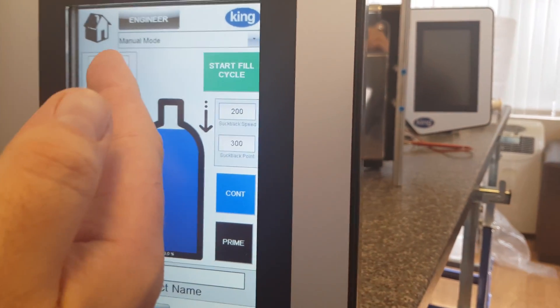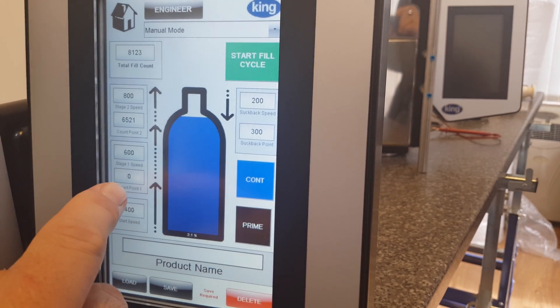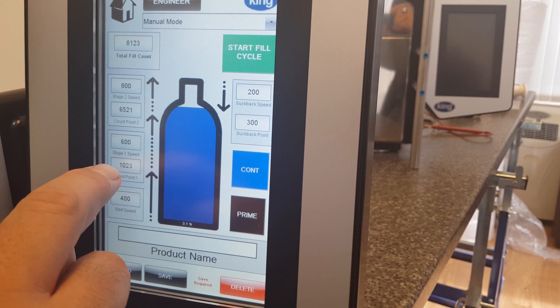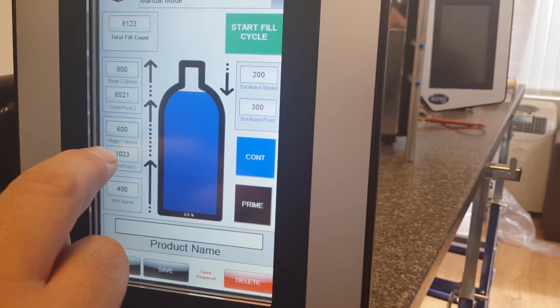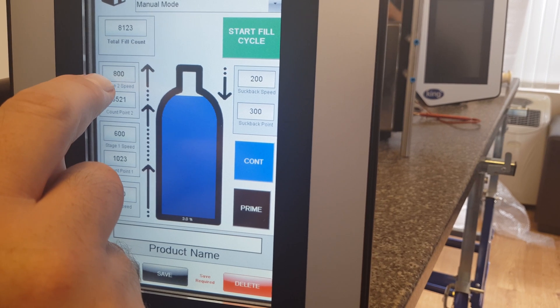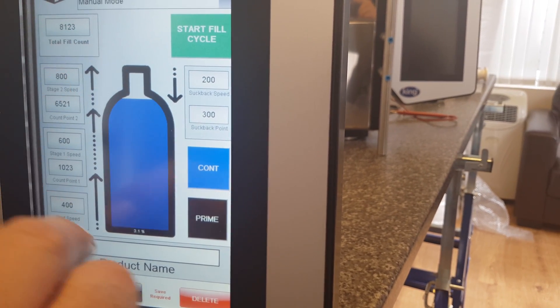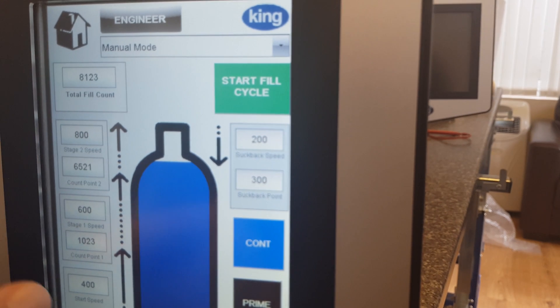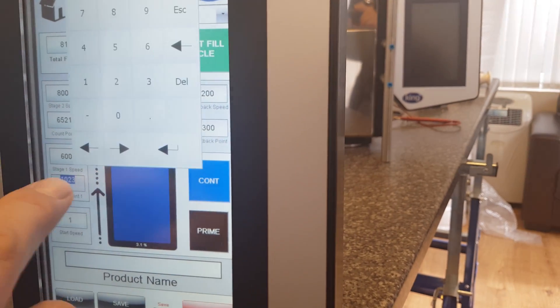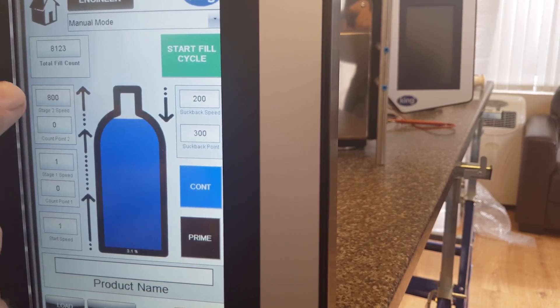So it's going to go at 400 RPM and count 1,023 pulses, and then at that point it's going to change the speed to 600 RPM and count up to 6,521. And then at that point it's going to go to 800 RPM and count up to 8,123. So these points are like stages in the fill — the total count is 8,123, but we start off slow to that point and then go quick. I would suggest that you just leave that at a normal setting: the speed and it counts to that.